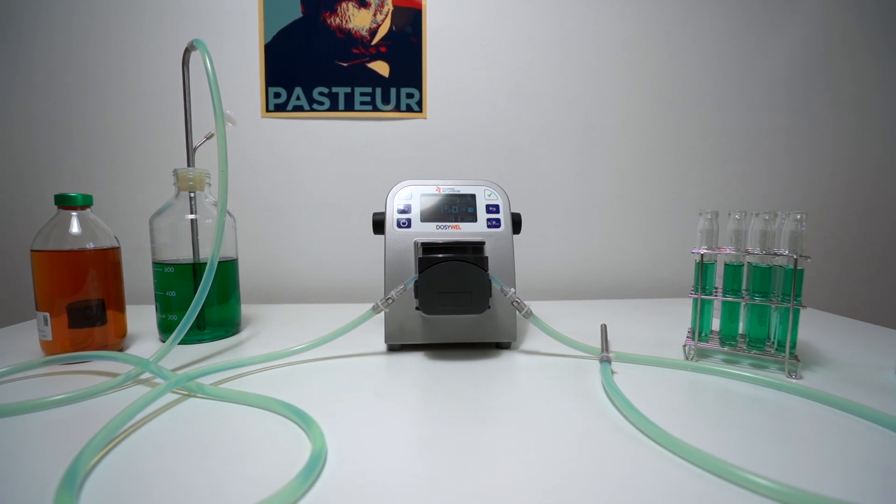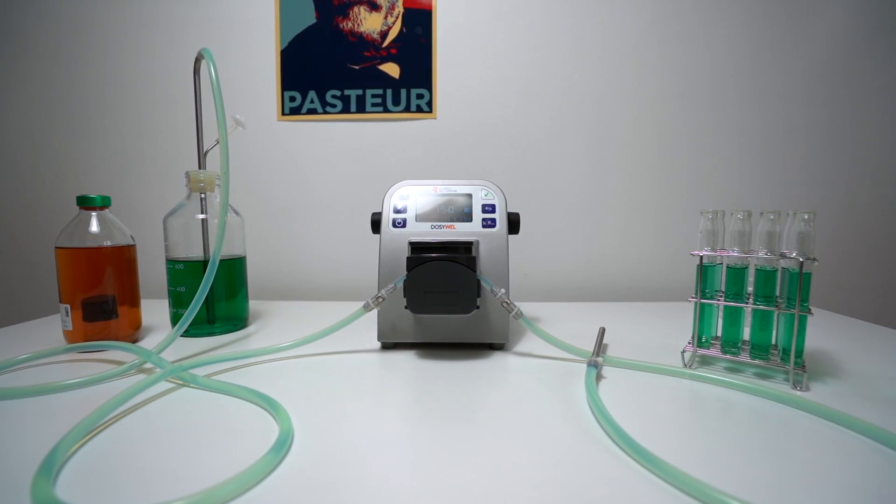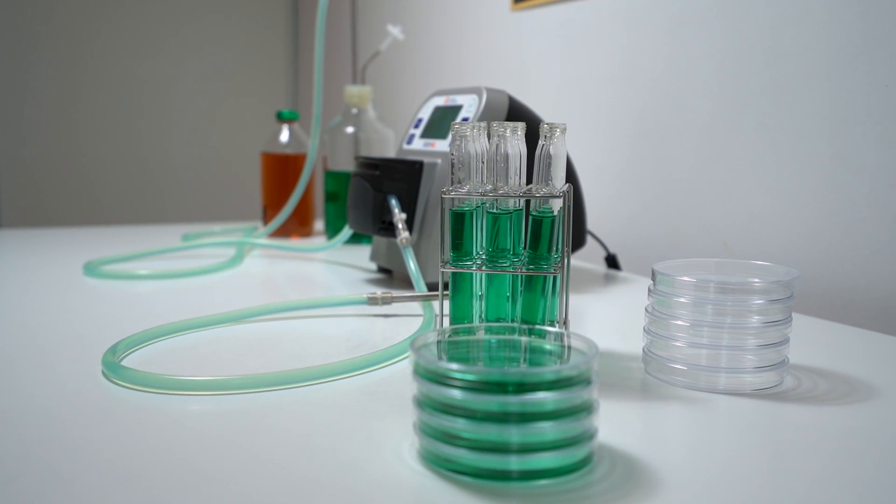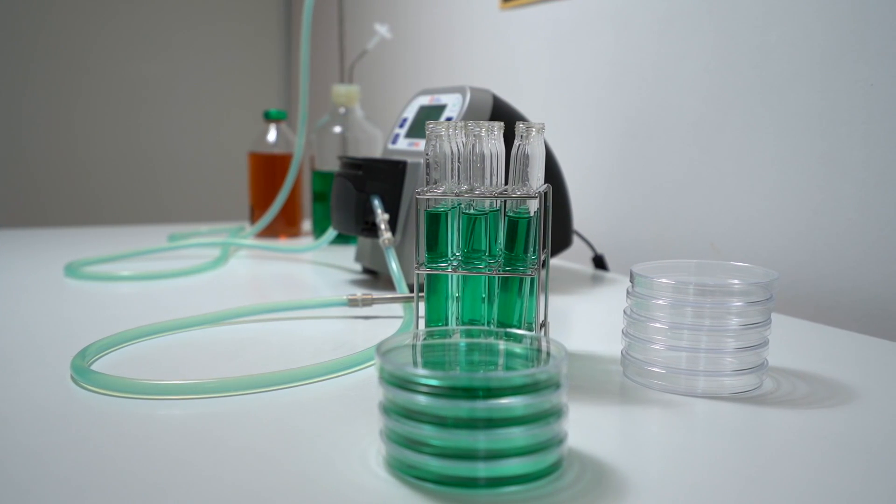Today we are going to talk about a peristaltic pump for your microbiological lab. Usually when you are using such a tool, it's because you want to make your own media — because of short shelf life or because you have a specific formulation — or sometimes you just want to transfer from a bottle to a tube, to a plate, to different formats.